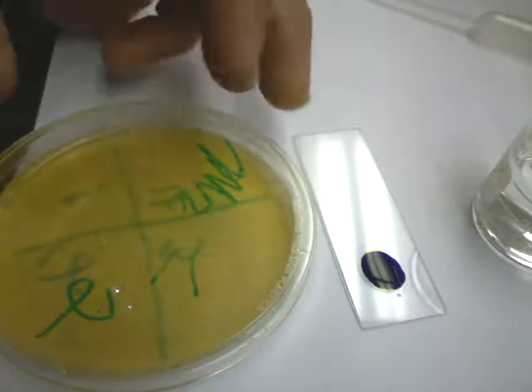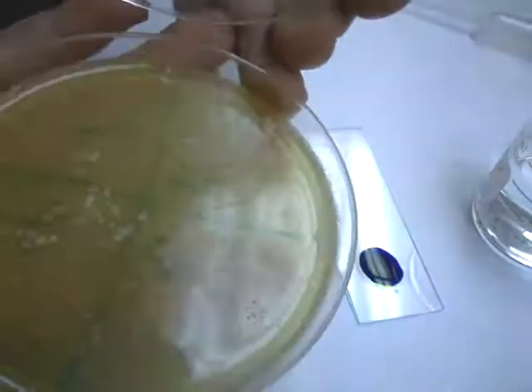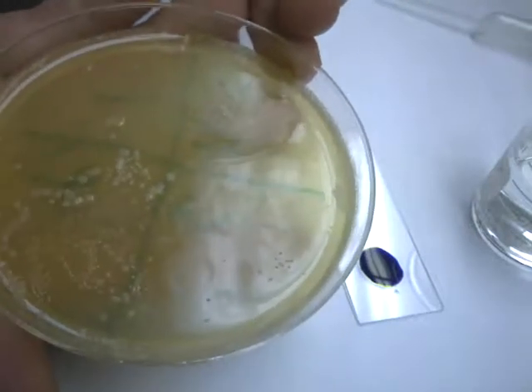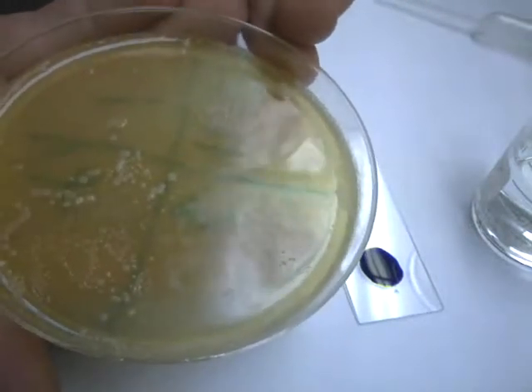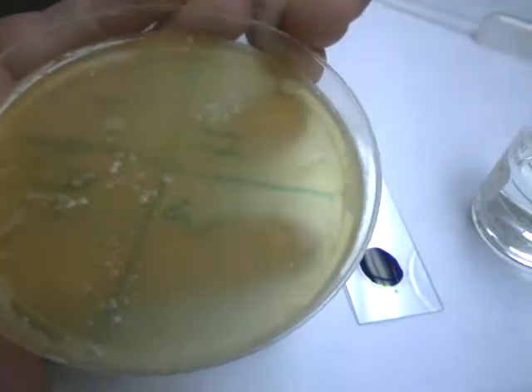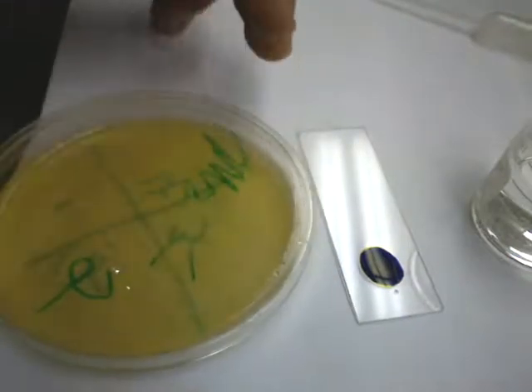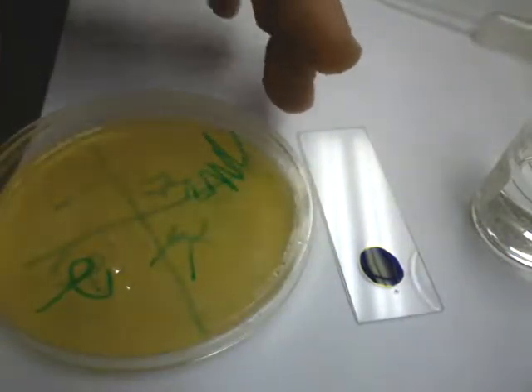Alright students, it's 24 hours since I did the plate yesterday, and if we have a look, we can see there is stuff growing. Your plates will probably have similar things on them. We're going to look at how to get some of these off the plate and do a very basic stain. We'll do a more advanced stain called a Gram stain later, but for now we're just going to stick with a standard purple stain.